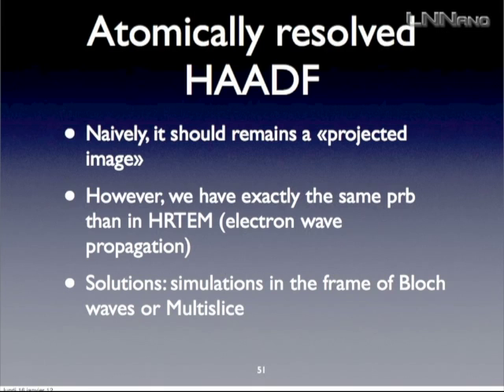It seems that it would be very nice, because I told you, okay, HAADF is just something proportional to a certain power of Z, of the atomic weight. So if I have a nice crystal which is well aligned, I should have very nice images of the atomic columns, just like maybe the one I showed you at the beginning. So this is right. You can make very nice things, but don't think you avoid any of the problems you have in high resolution TEM.